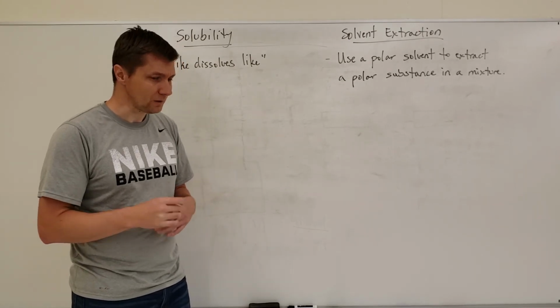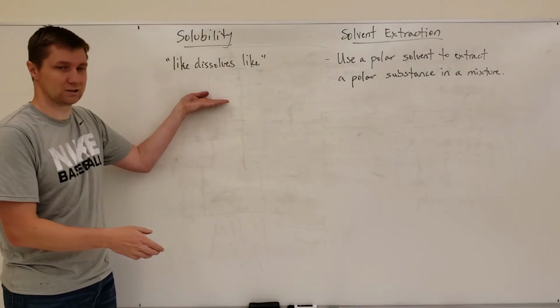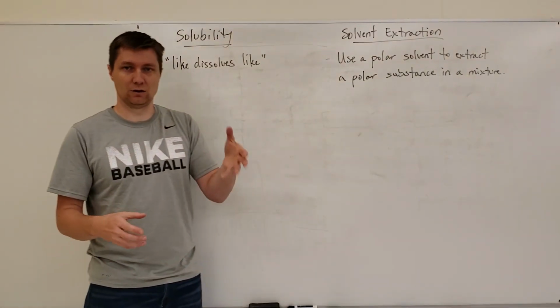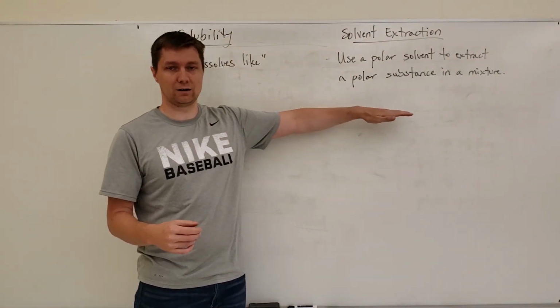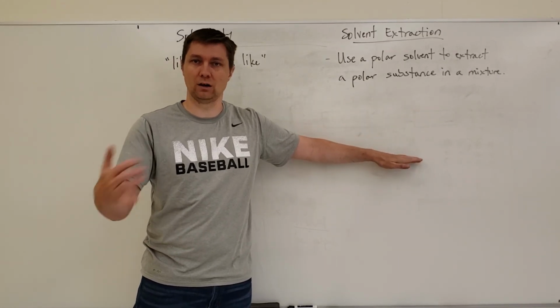And so understanding that if you're doing solvent extraction, you have to follow this concept of like dissolves like. So if I want to extract a slightly polar substance out, I have to use a slightly polar solvent in order to do that.